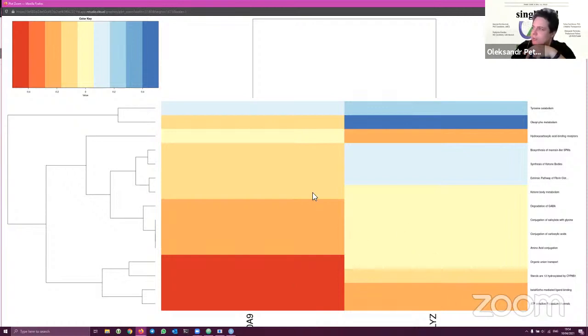So the proper idea would be to make somehow equal representation of both cell types, for example, to get more data sets or to sequence more cells and then compare them. Because for this left, we had a few hundred, I think, and for the right, we had like 1,500. So it can be one of the reasons, like this technical issue. However, if we are very confident in our cell populations and we are sure that we made the quality control steps correctly, if we're sure that we made the integration correctly, and we can play around with this and see how it impacts our analysis, by the way, then we can actually make suggestions regarding the pathways which are involved or affected in specific diseases.